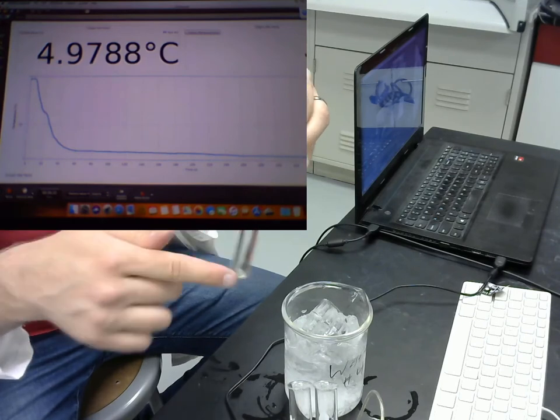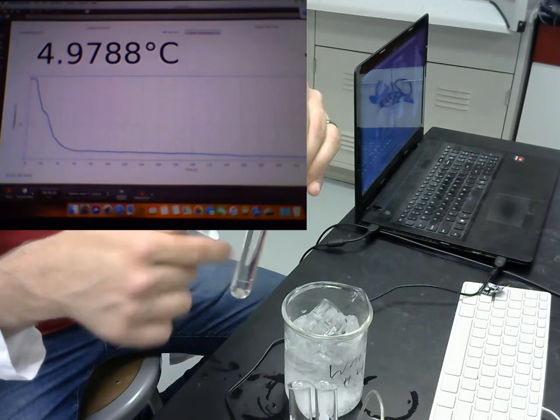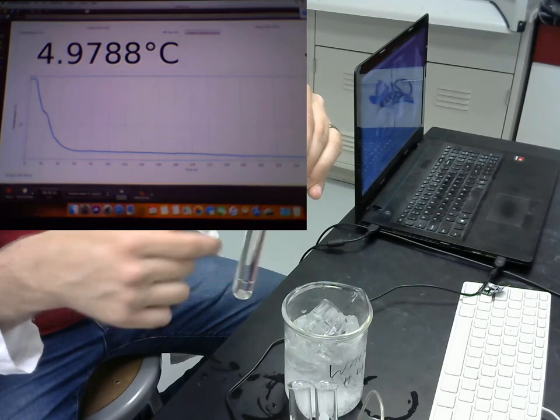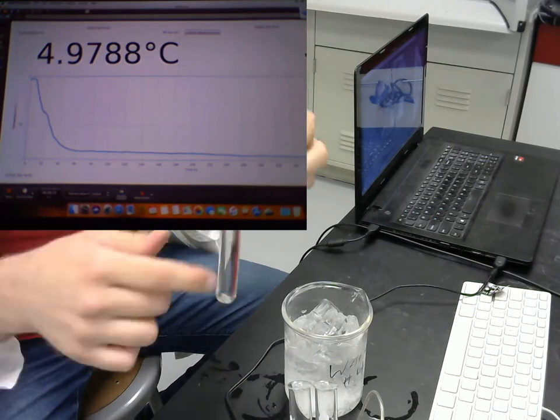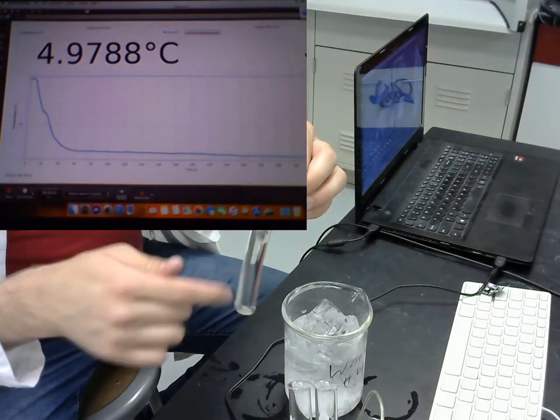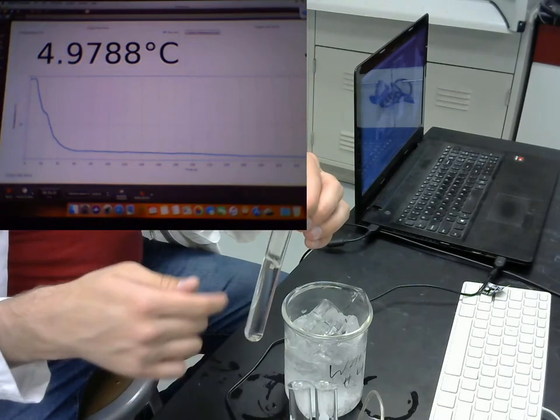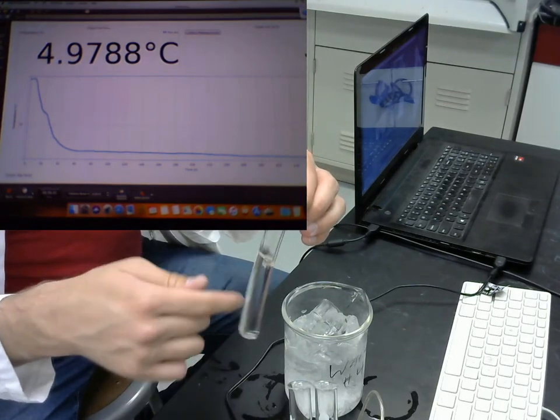What I really probably should have done was mix these two in a beaker where it's much easier to achieve good mixing, and then poured the beaker's contents into the test tube. I think this will do. And now you just get to see one way to deal with problem solving along the way in the lab.